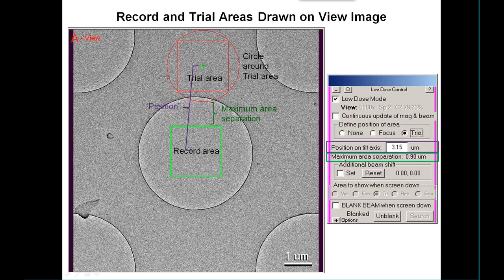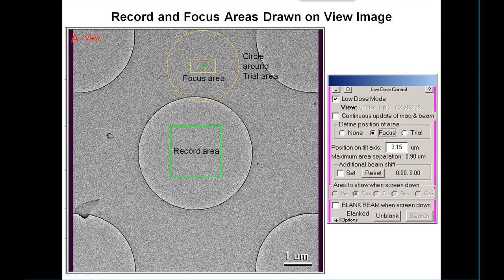The maximum area separation is the distance between the outside circle and the record area, whereas the position is the distance between the centers of the areas. When you select to define the position of focus, you'll see things highlighted in yellow. The circle shown is still the circle around the trial area, just so you're reminded that you're going to be taking pictures that big one way or another — and that's likely to be how big the beam is.